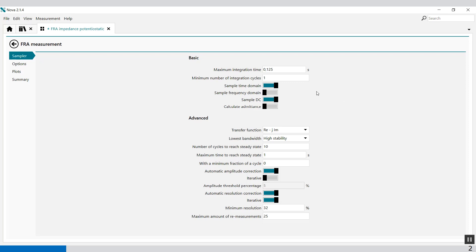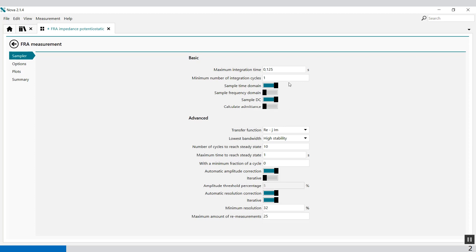Then you have the sample DC. It defines if the DC component of the two input signals, potential current or external signals information, should be sampled during the FRA measurement using the provided toggle. This option is active by default. You can also calculate the admittance, that's the inverse of the impedance. So these are the basic settings.